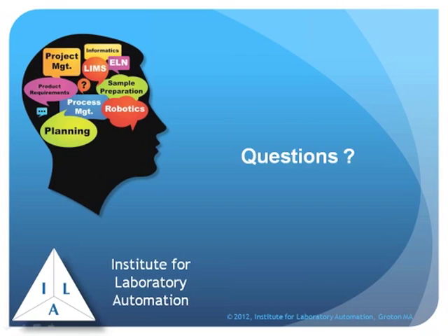Okay, excellent. The next question is, why is integration of instrument systems as big a problem as it is? There are basically two reasons. One is the lack of standards, and this is something we're going to be beating on over and over again. We need two types of standards. We need standards for communication between systems, and then standards for the content of the messages, basically data format standards, that allow systems to exchange information from different types of instruments effectively.